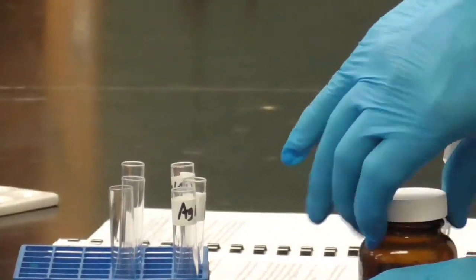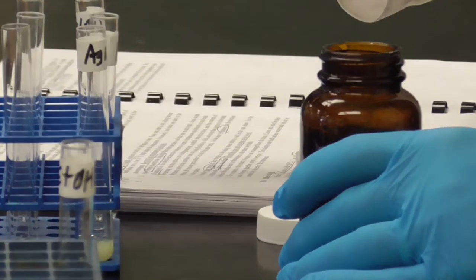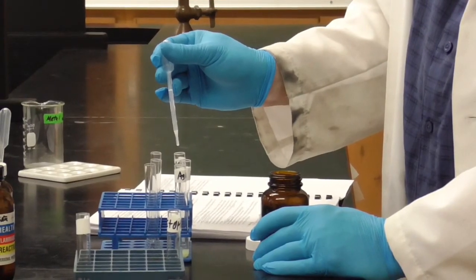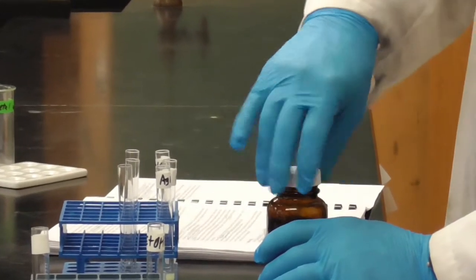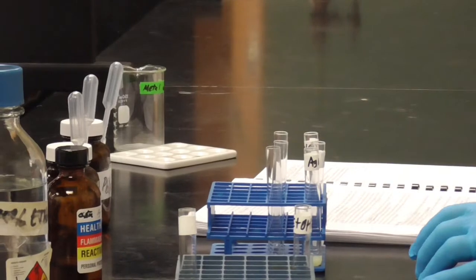And the possible inhibitor, lead, as in lead nitrate. Okay, so we have our enzyme and our possible inhibitors in each test tube.